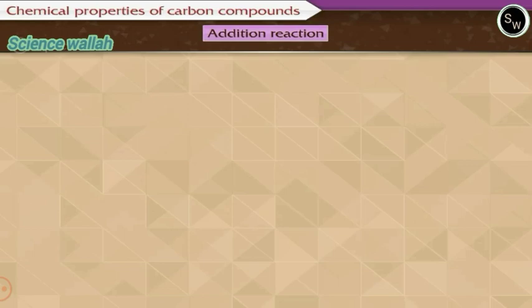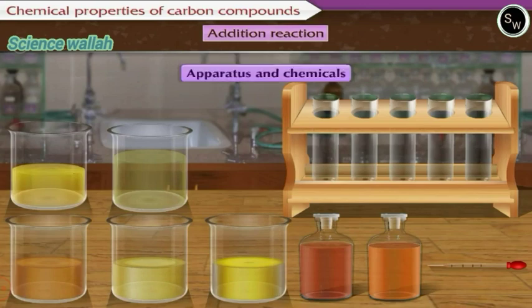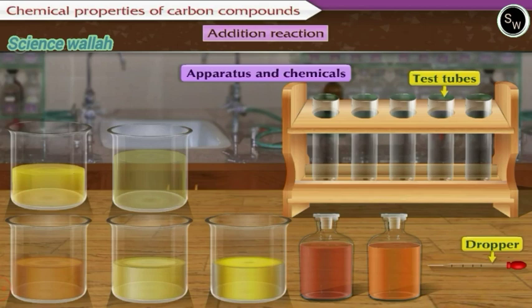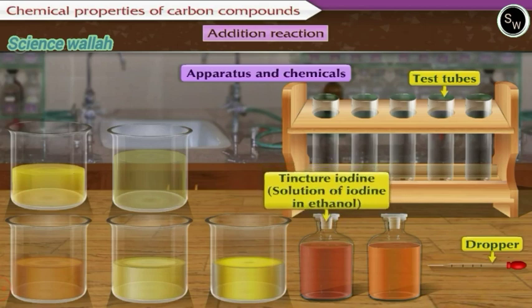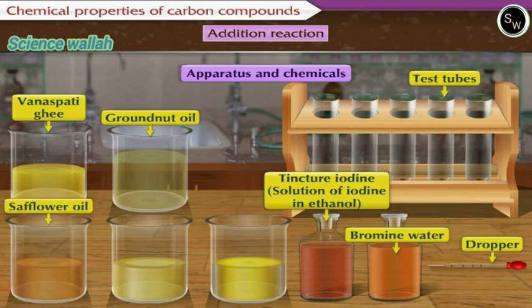Addition reaction: to understand the addition reaction, let us perform an activity. The apparatus required includes test tubes and dropper. The chemicals required are tincture iodine (that is, solution of iodine in ethanol), bromine water, liquefied vanaspati ghee, and various vegetable oils like groundnut oil, safflower oil, sunflower oil, and olive oil.